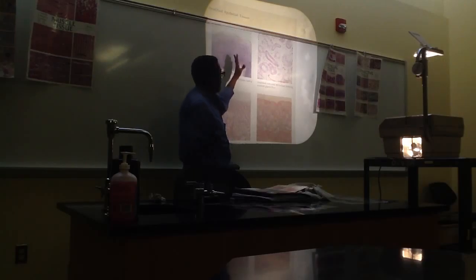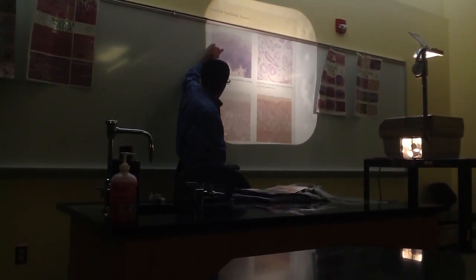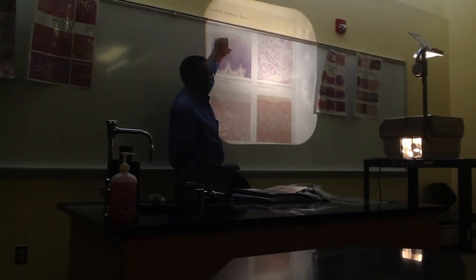Okay, so whenever you have stratified tissue, notice that we could have some cuboidal shaped cells, judging by this round nucleus. All right, some kind of flattened cells, but what's going to determine the shape will be the shape of these nuclei closest to the free space. So what kind of shape would this be? Squamous, okay? And so we're sure that this is stratified, we're sure that these are squamous. So the name of this tissue is stratified squamous epithelium.